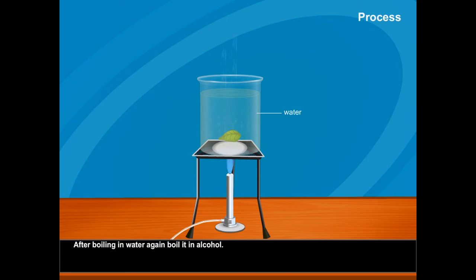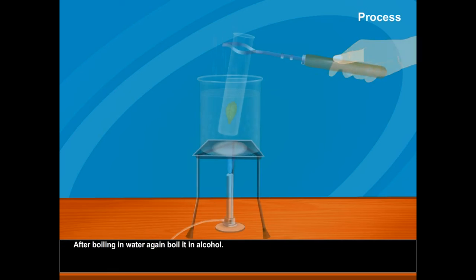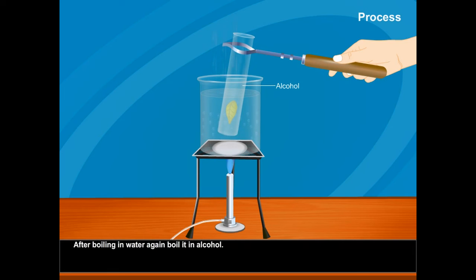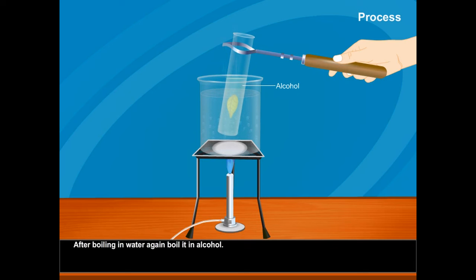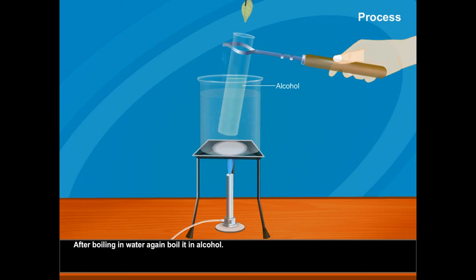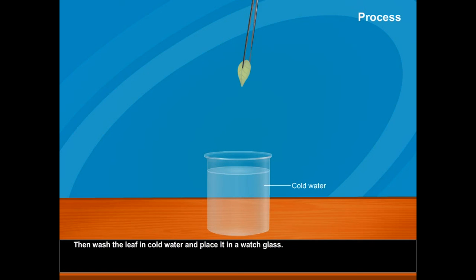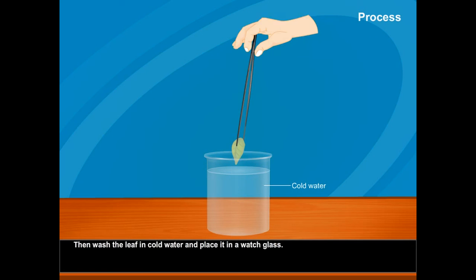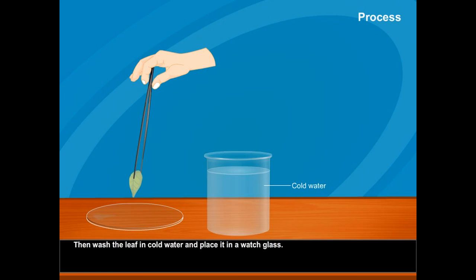After boiling in water, again boil it in alcohol. Then wash the leaf in cold water and place it in a watch glass.